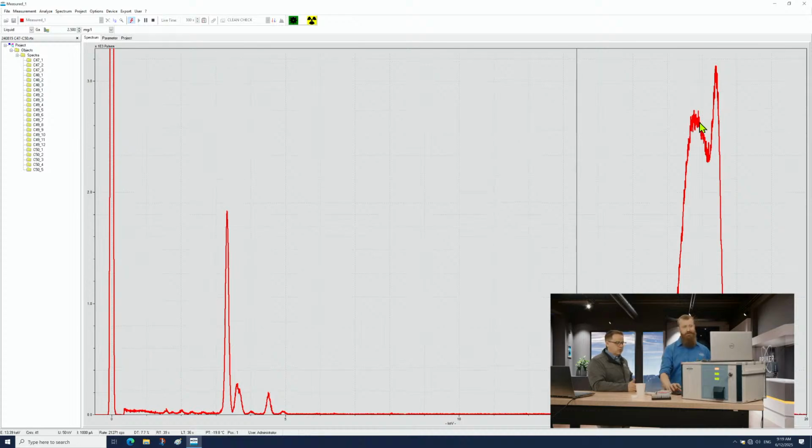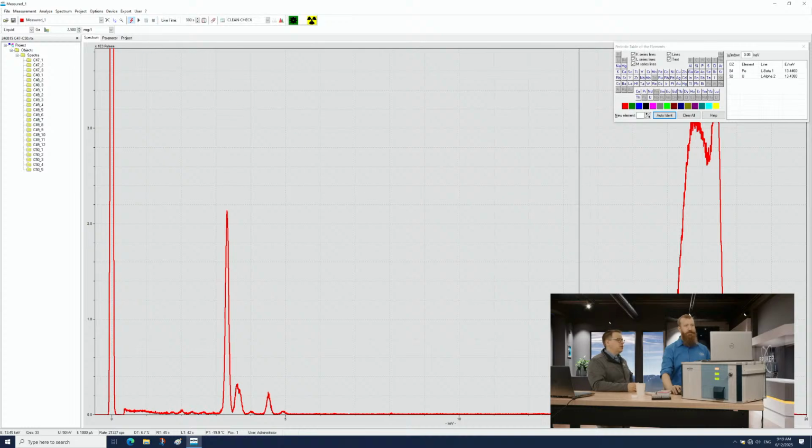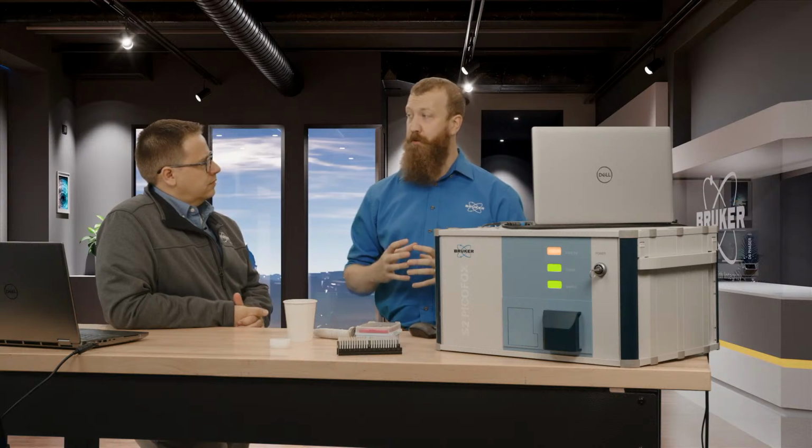All right, so what's in the coffee here? Well, let's pull up an elemental list here. I'm going to stop the collection so I can look at things a little bit better. Now, to be clear, when we look at the results here, we're going to be seeing elements. We won't be seeing, oh, there's a caffeine peak. No, unfortunately. The 17.5 keV energy range is enough to kick out an internal electron from one of the lower orbitals in an atom.